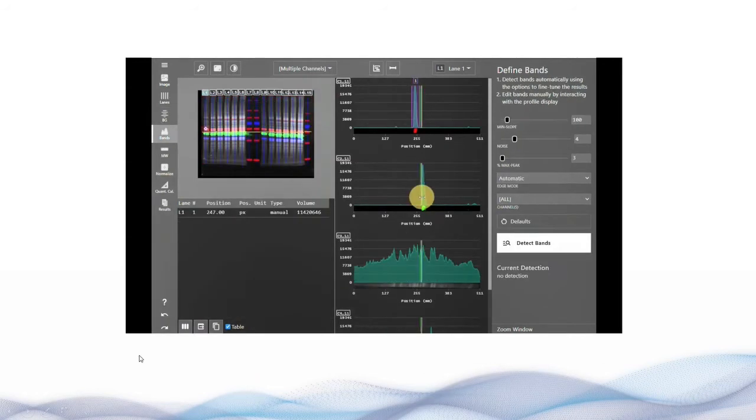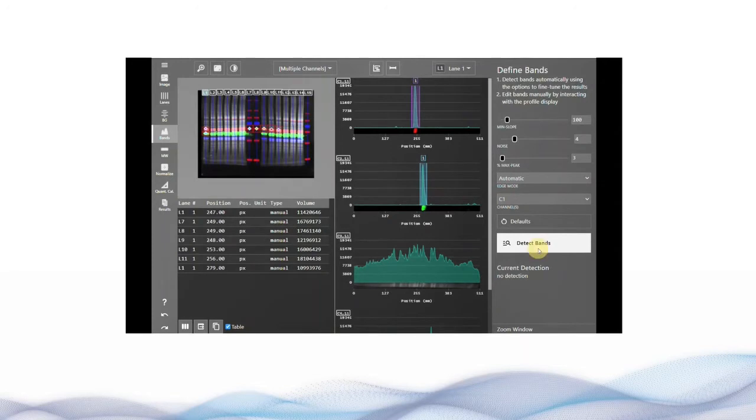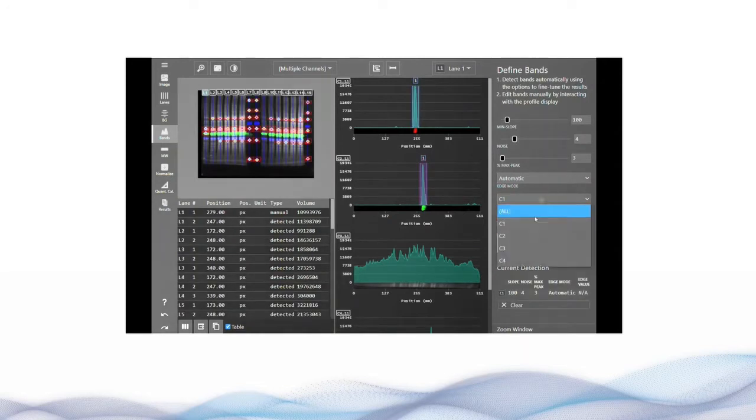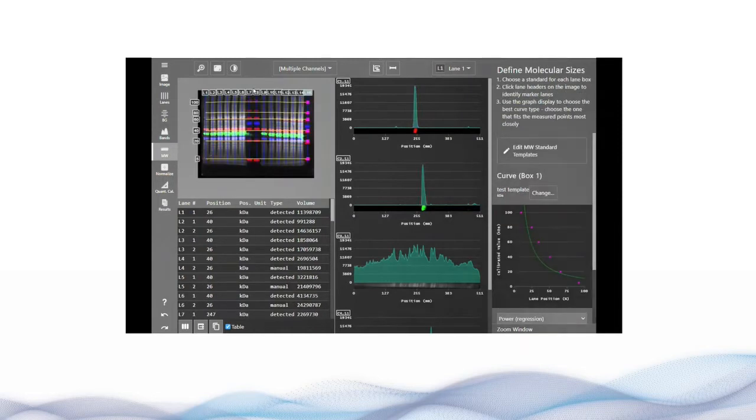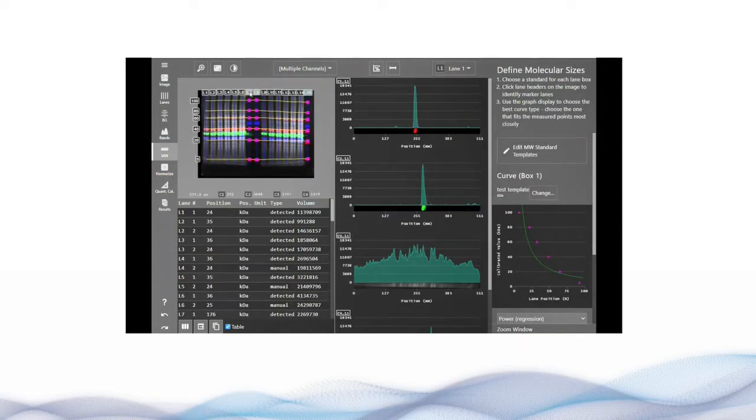To learn more about the basic multiplex workflow of finding your lanes, subtracting background, defining your bands, and your molecular weight, visit azorbiosystems.com.